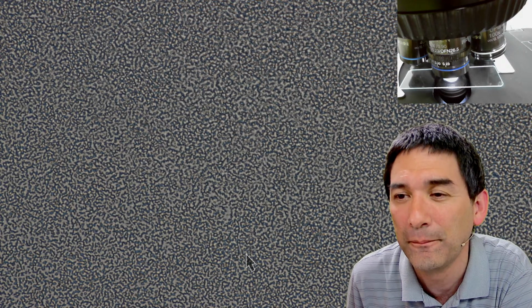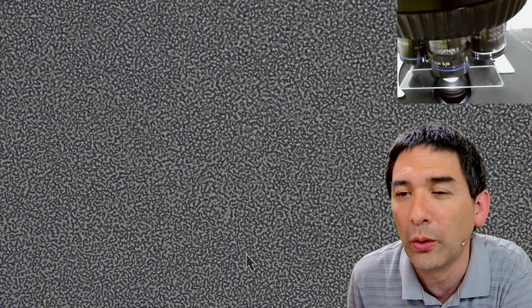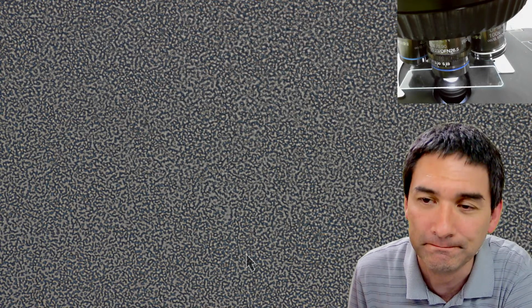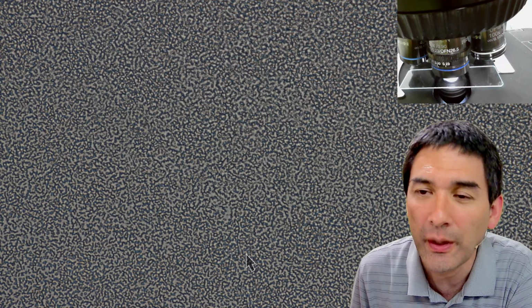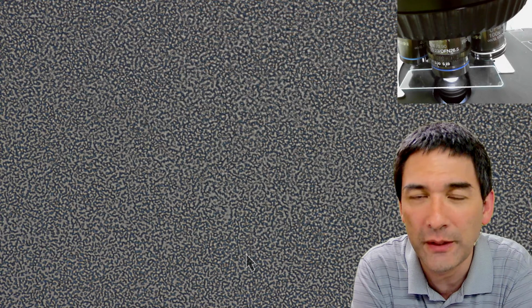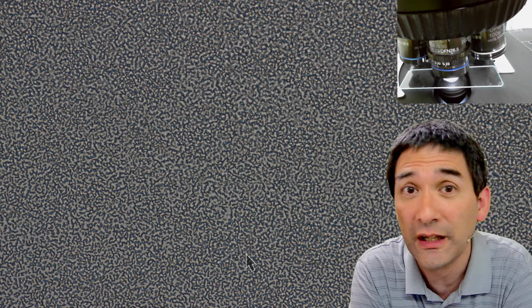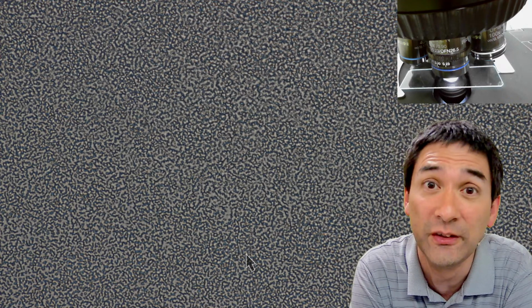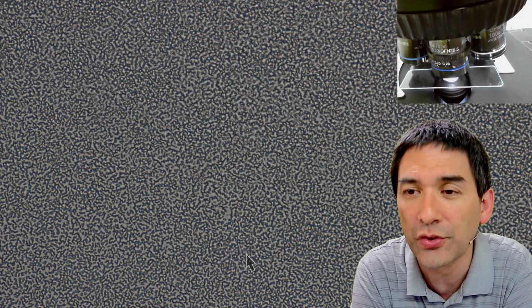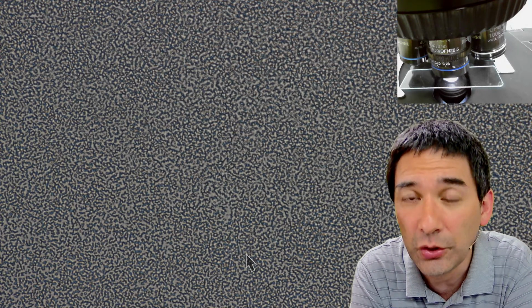Does the microscope camera quality also depend on the computer quality? Well, the image, no. Let's put it this way. The quality of a microscope camera depends on a variety of parameters: the resolution, of course, the chip size, the signal to noise ratio. Generally, modern microscope cameras that you can buy are definitely good enough.